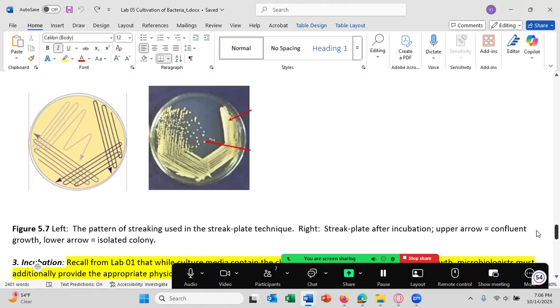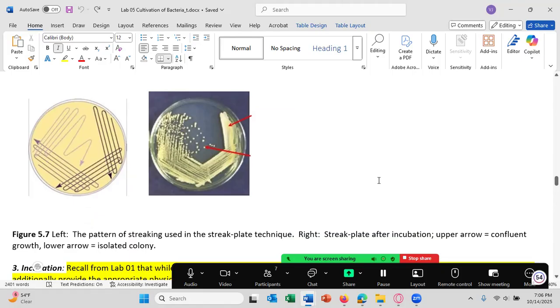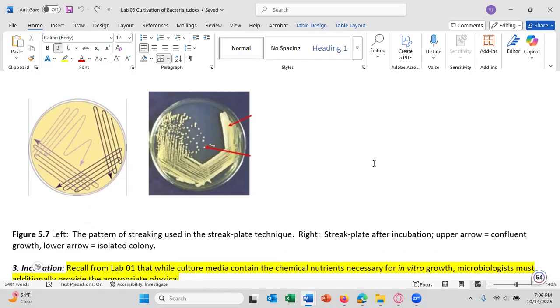All right, let's talk about streak plating. To do this correctly, you sterilize your loop by putting it either into the flame or the bacto incinerator, and then putting it into your bacteria. So let's pretend this is the bacteria and it's a mixed culture. You cool the loop on the inside. I'm not going to touch the inside because this is a dirty pencil. This is my glass. Let me get something that I don't care if I contaminate. There we go.